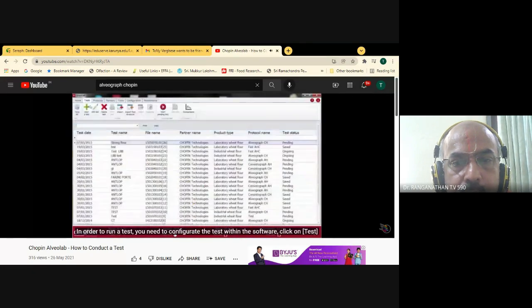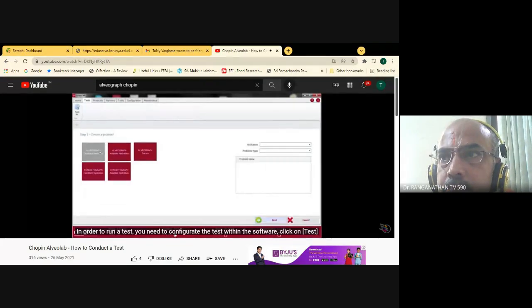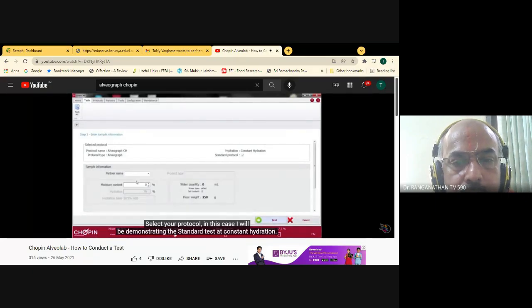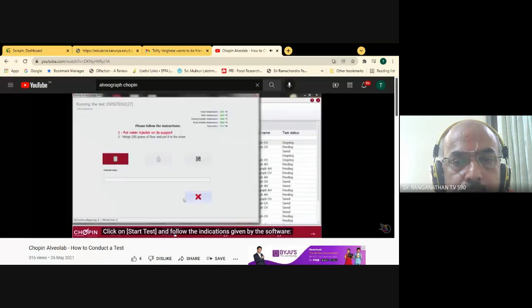In order to run a test, you need to configure the test within the software. Click on Test, then on Start Test. Select your protocol. In this case, I will be demonstrating the standard test at constant hydration. Enter the name of the test, select a partner and a product, and indicate the water content of the flour. Click on Next to see a summary of the configuration of your tests. Click on Start Test and follow the indications given by the software.